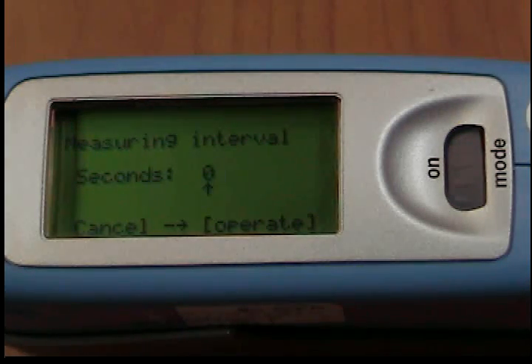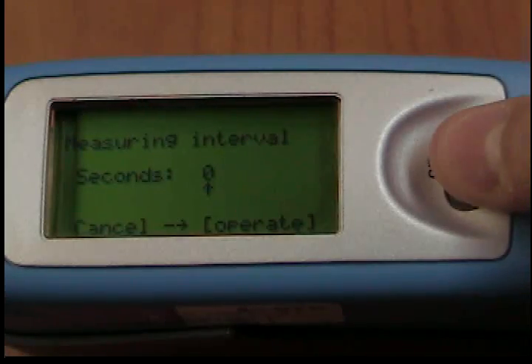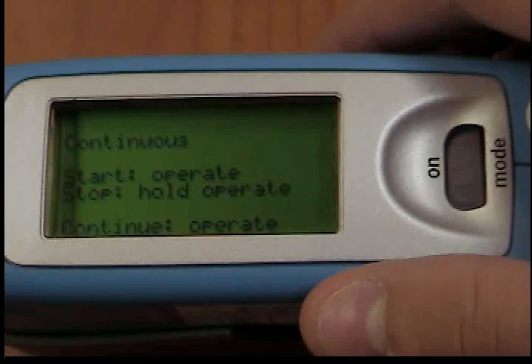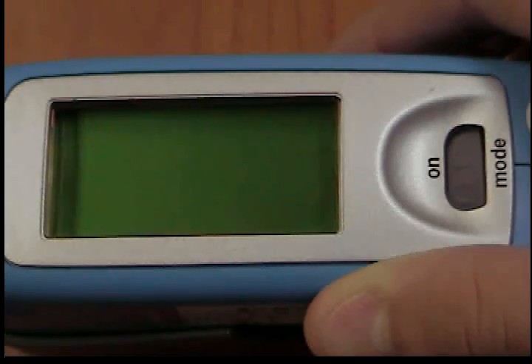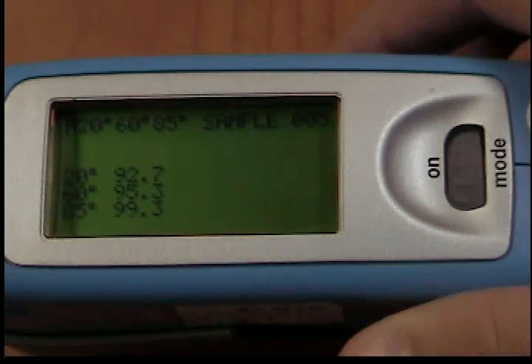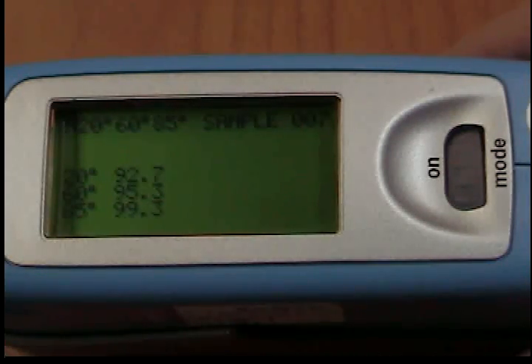To start a continuous measurement, press the OPERATE button. A note in the display also tells you this. If you would like to exit the continuous measurement, press MODE. To start the measurement, press OPERATE. The unit now performs measurements up to 99 times at the set interval. Measurement values are shown in the display after each measurement.